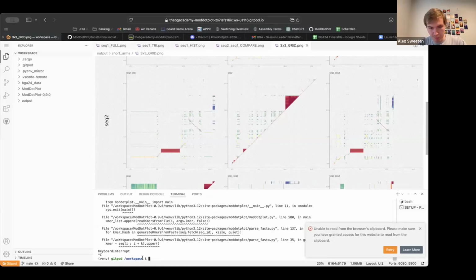Ooh, I got the wrong folder, so I'm going to switch my command. I'll just do it by hand because it's faster. We want rDNA. So we want to find our FASTA files in the rDNA folder. It's going to be in BGA data, rDNA, we want all.fasta.